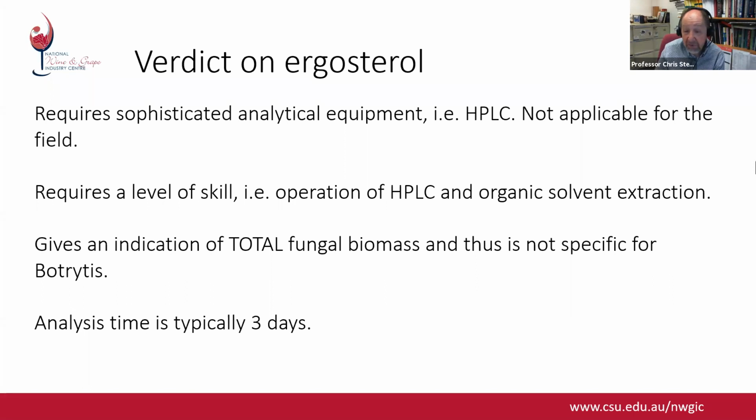It does give an indication of total fungal biomass and is thus not specific for Botrytis. But in those situations with those slides that I showed you for the Hunter, you could see it was only Botrytis. But again, there is not 100% specificity for Botrytis.